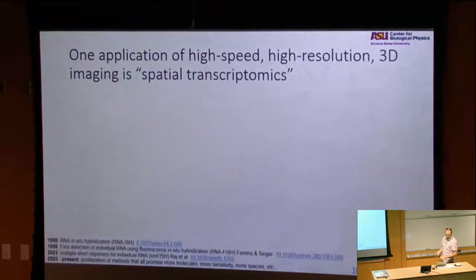And so for the last 5 minutes, what I want to talk about is the thing that has gotten the biologists excited about this instrument. We're funded by both the Chan Zuckerberg Institute and the NIH to work on something called spatial transcriptomics. So what is this? Have people heard of RNA sequencing? RNA sequencing sequences all the RNA inside a cell. There's a movement to do this with imaging. So how does that work?